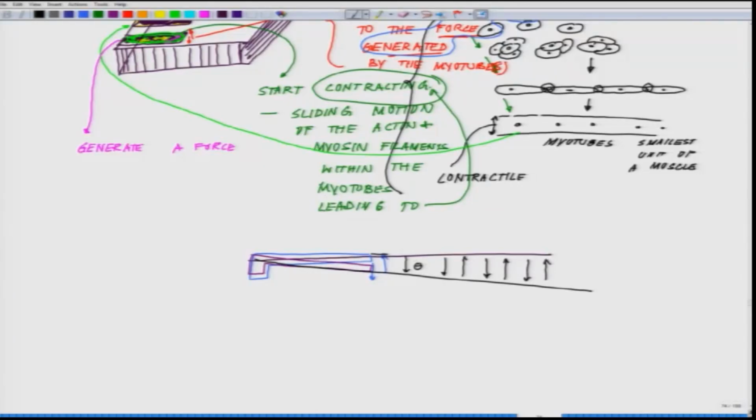If you repeatedly measure this theta angle, most likely it is not going to change, but even if there is a slight change, you average out all the theta angles.